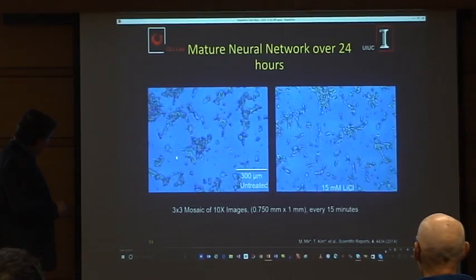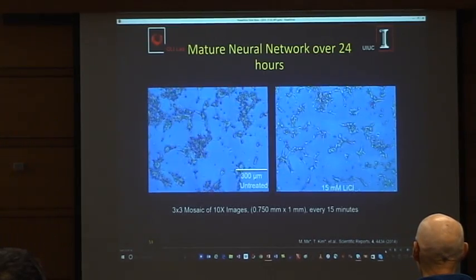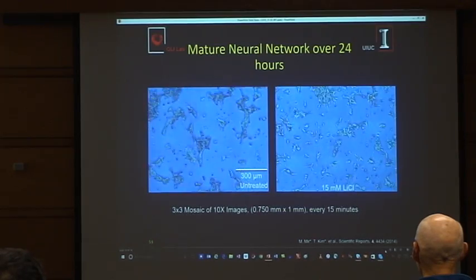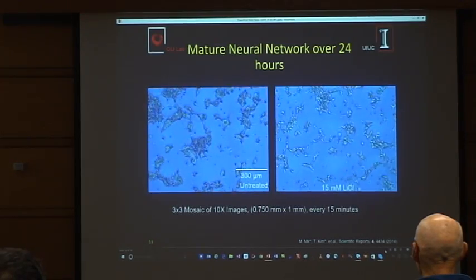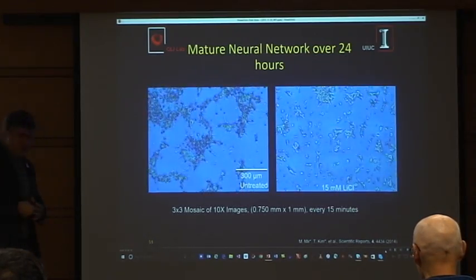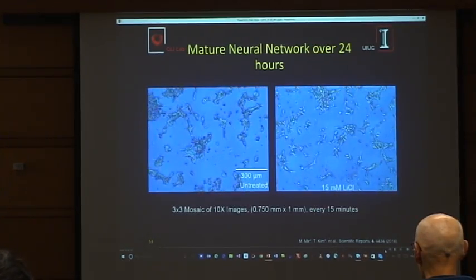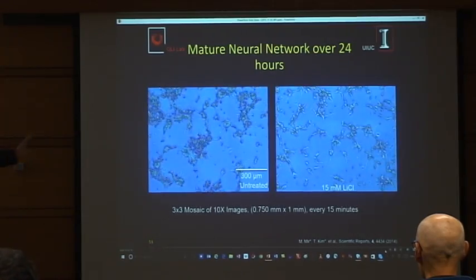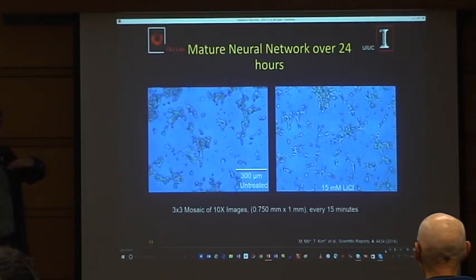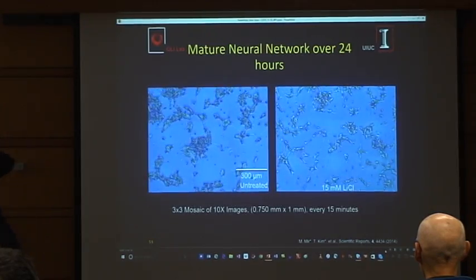But if you look at these clusters, what you notice is that the neurons are extending, they're growing these actin filaments, and then they're looking for neighbors. And at some point, they snap into place. So for example, if you look here, you will notice some of that. They snap into place, make a connection, then they're kind of focusing their attention on the next neighbor. I think people model this with a random walk, so they're kind of randomly sampling the neighbors.